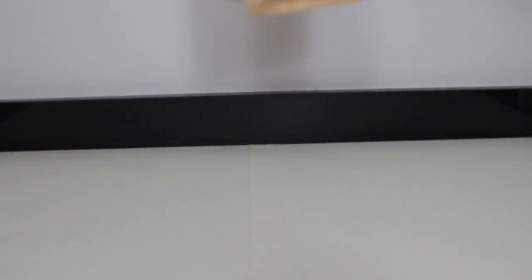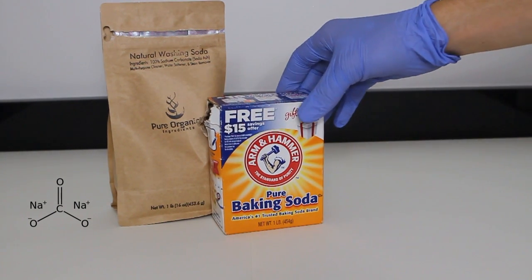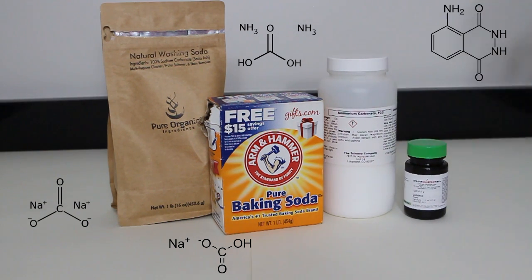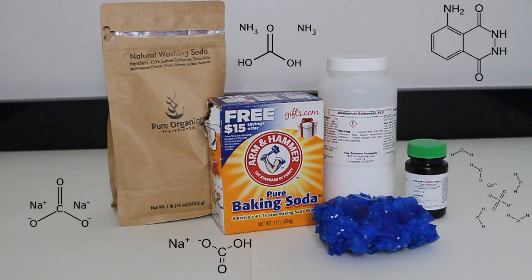In this demonstration, the primary solution contains sodium carbonate — which I found on Amazon for a relatively cheap price under the common name soda ash — sodium bicarbonate, ammonium carbonate, luminol, and cupric sulfate pentahydrate, which was purchased as a rock by the name of chalcanthite. Even though it is likely not perfectly pure, it would have been a waste of money to buy chemical-grade cupric sulfate pentahydrate when this works relatively the same, and would also double as a rock for my shelf.